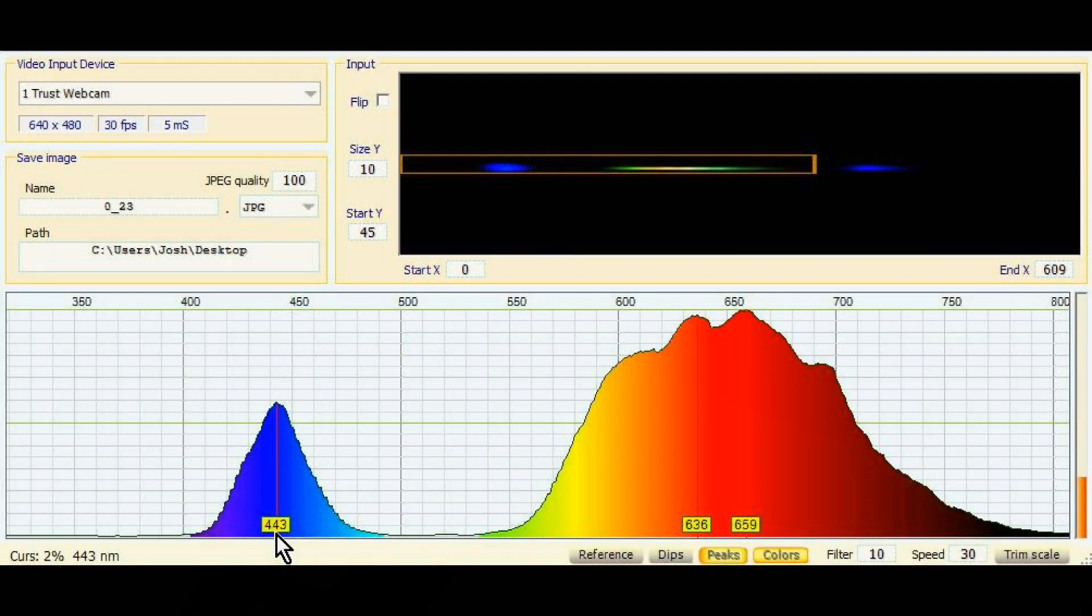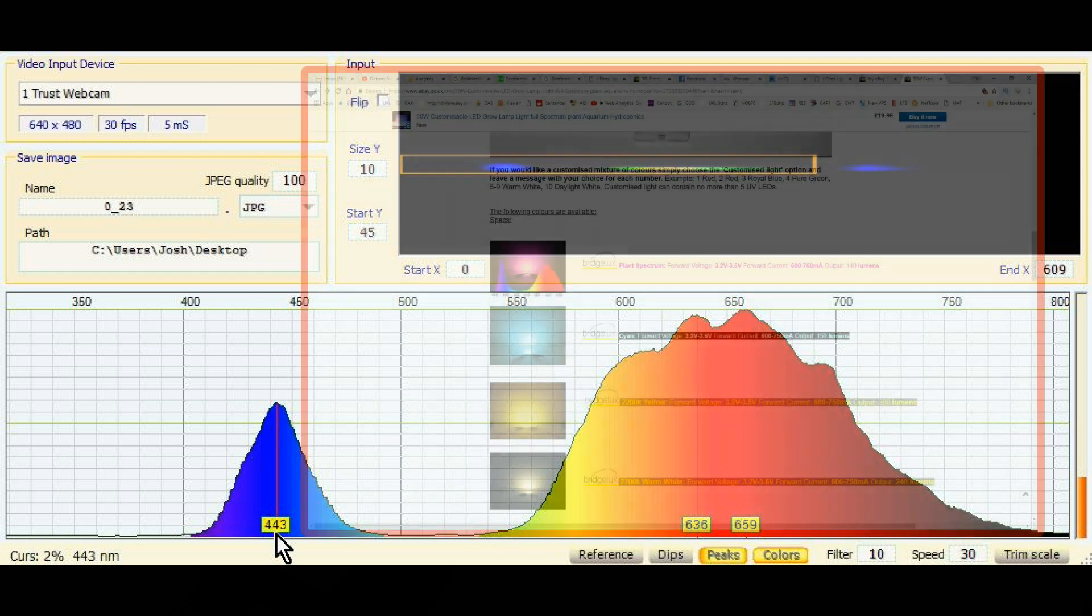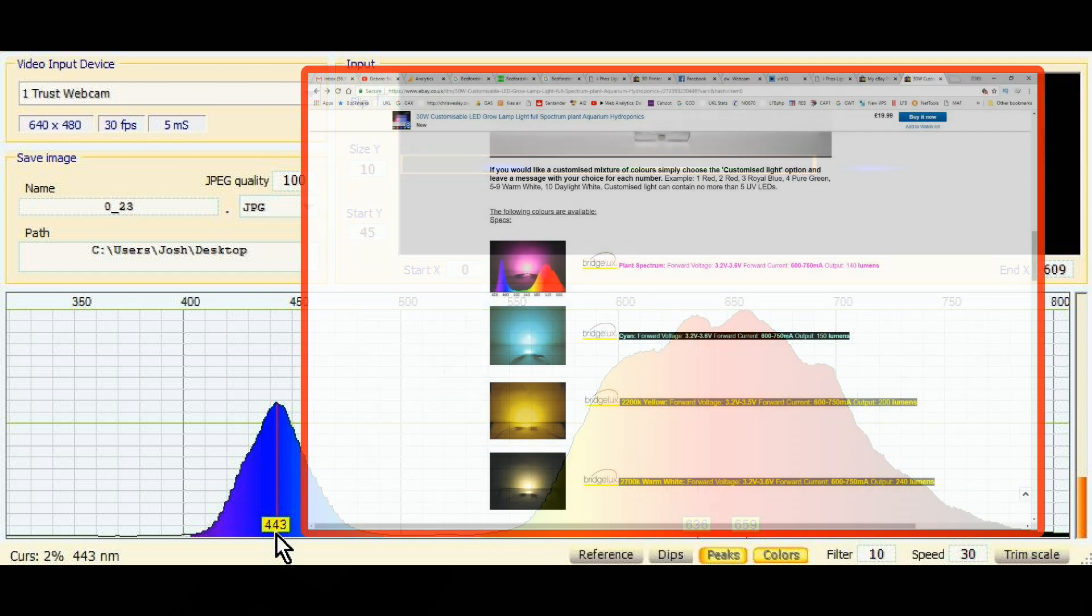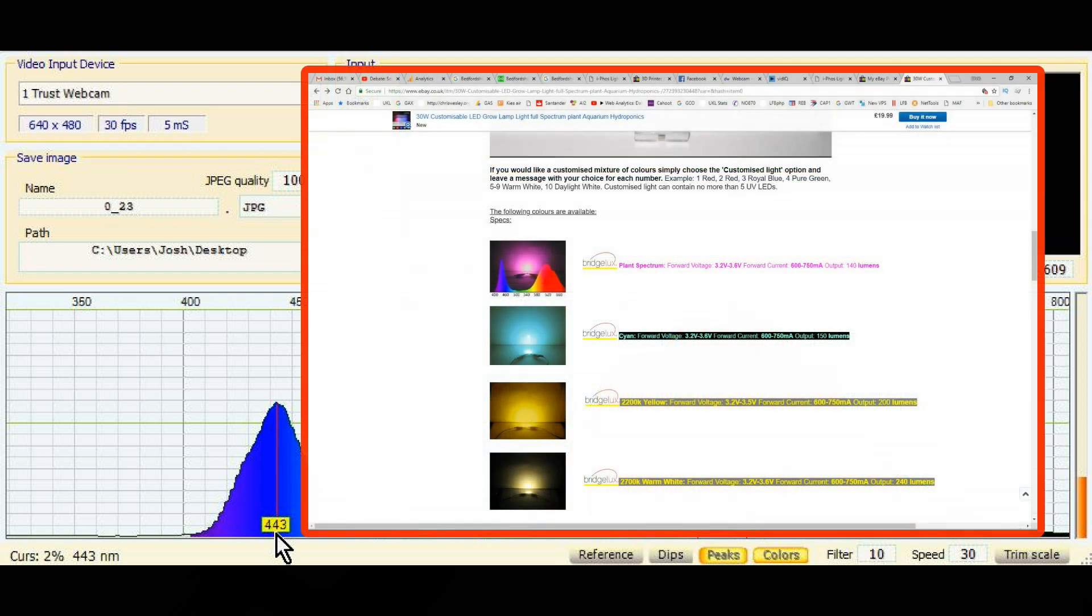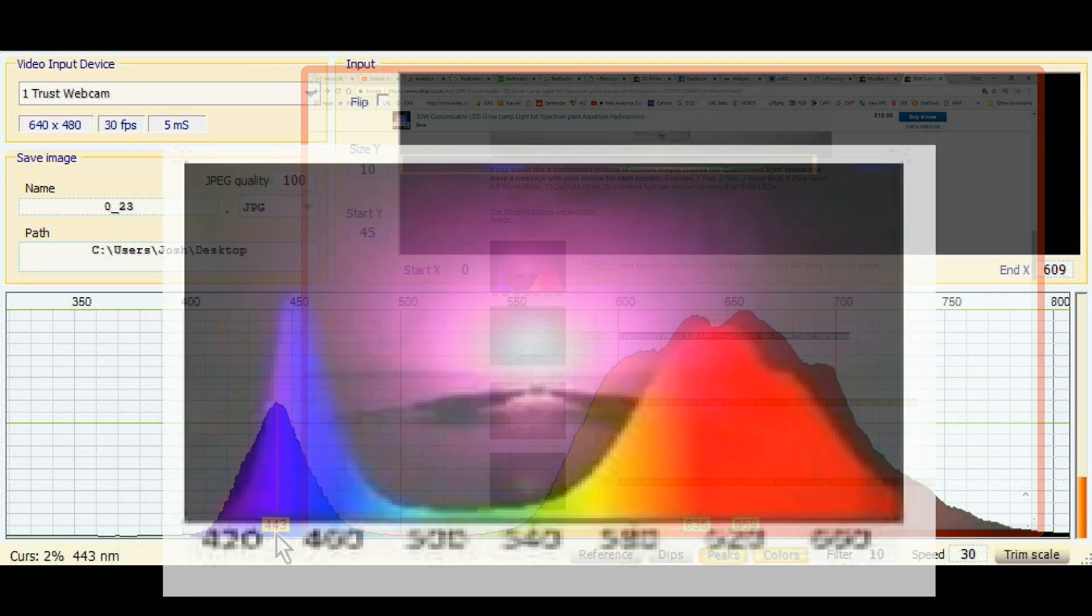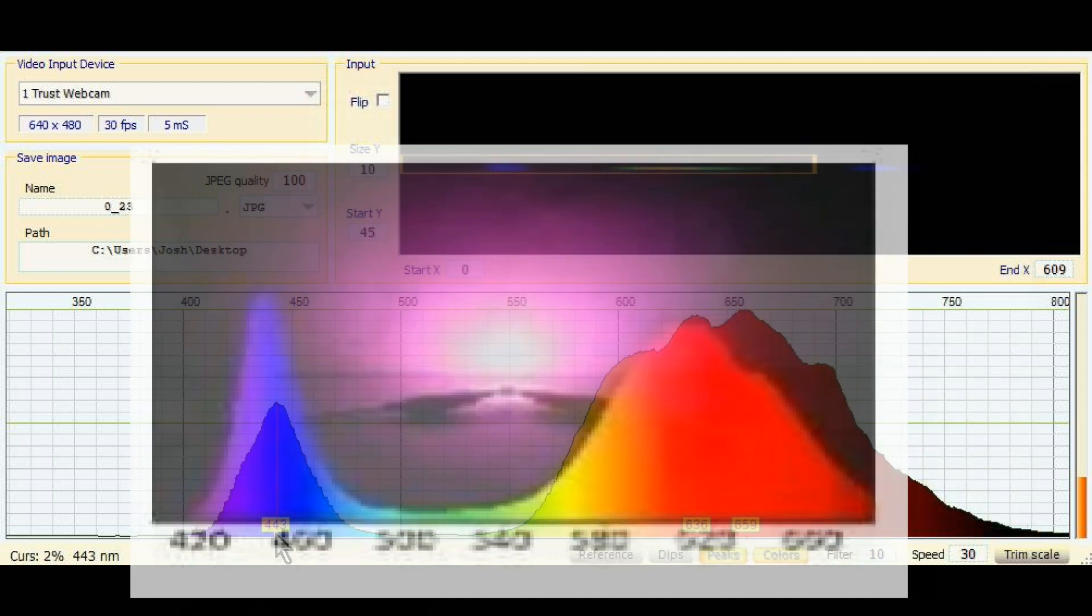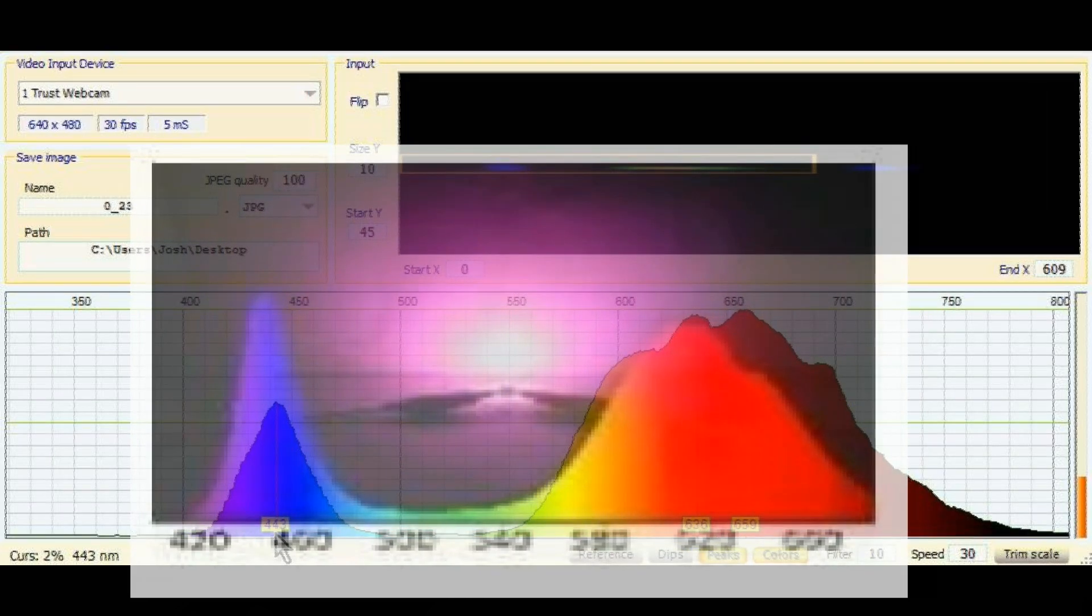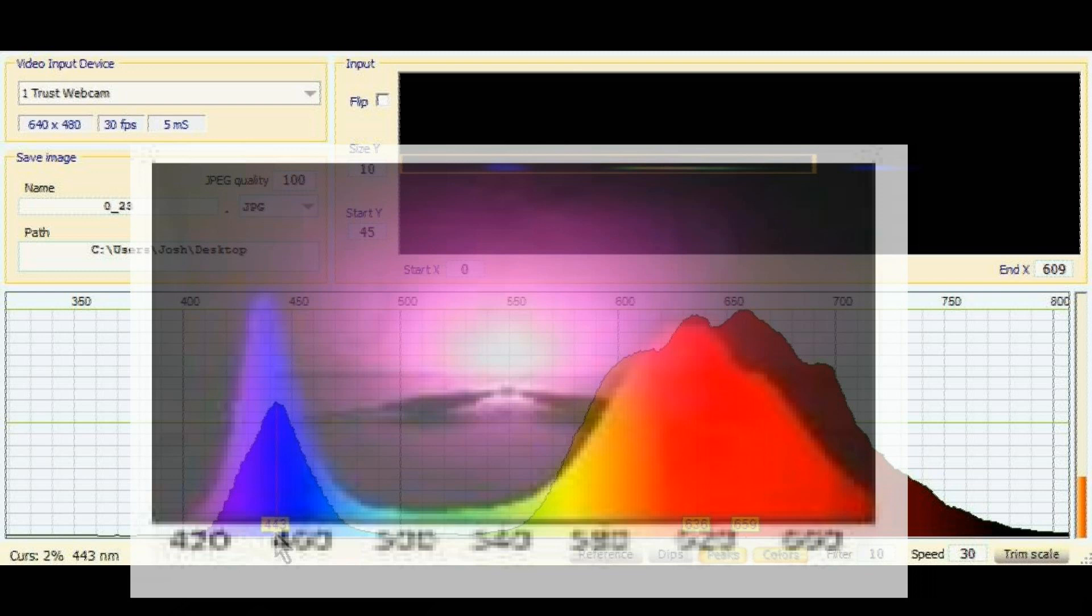Let's compare that spectrum with the spectrum they advertise in the sales listing. I'm lining up the wavelength scales on the bottom of both graphs and they're showing reasonably good agreement. There's a peak at 440 and then that big red region.